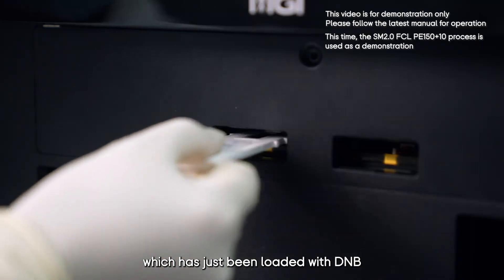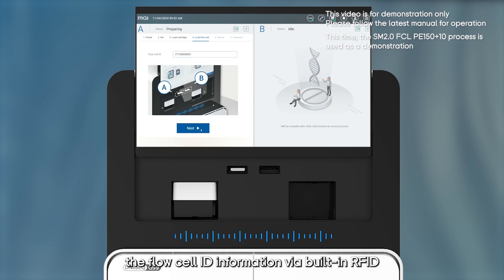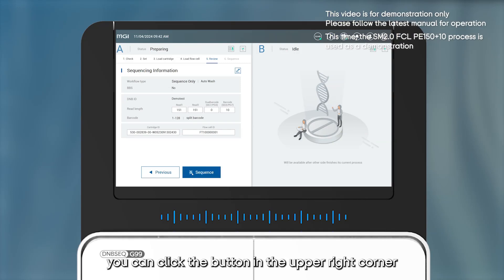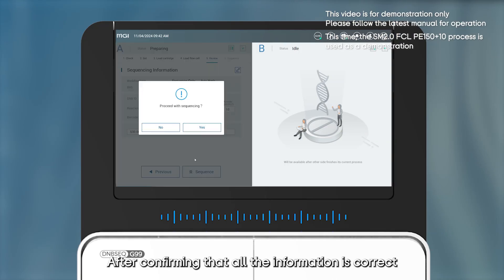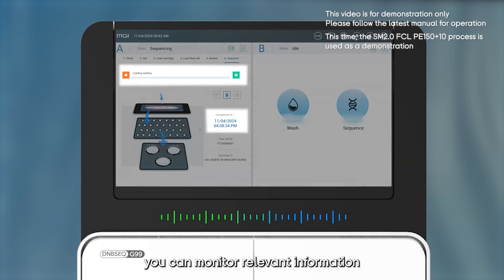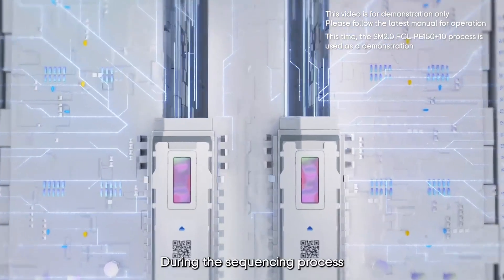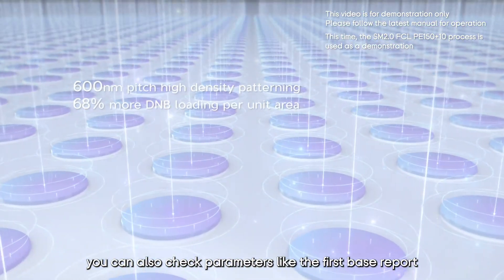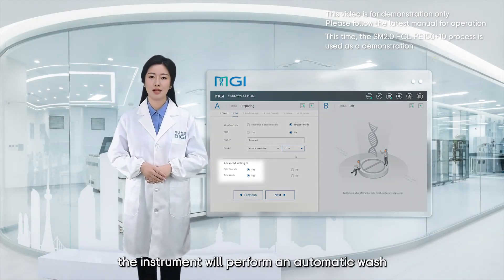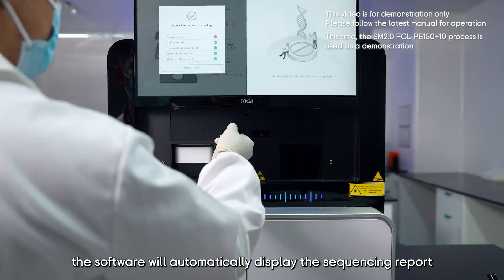After priming is complete, the screen will rise again revealing the flow cell compartment. Insert the flow cell loaded with DNBs into the compartment. The system will automatically read and recognize the flow cell ID via built-in RFID. Click Next to enter the review interface. If any information is incorrect, click the upper right button to make modifications. After confirming all information is correct, click Sequence and then click Yes to officially start the sequencing process. Through the sequencing software, you can monitor the sequencing stage, progress, and estimated completion time, as well as parameters like the first base report and Q30.